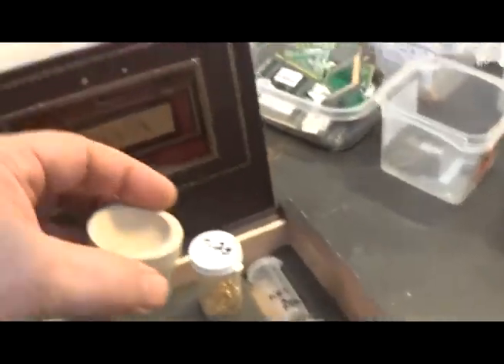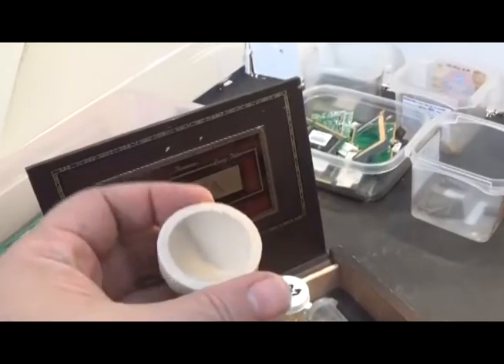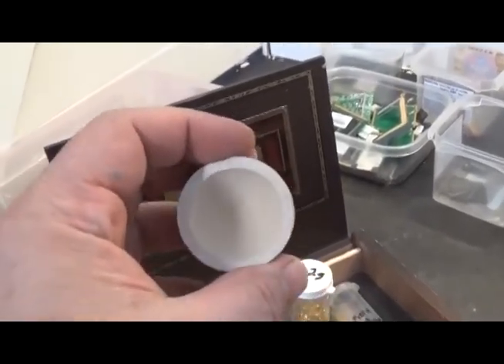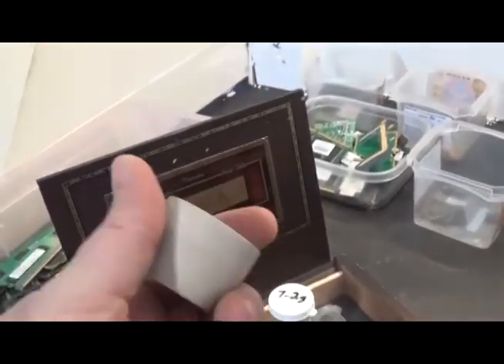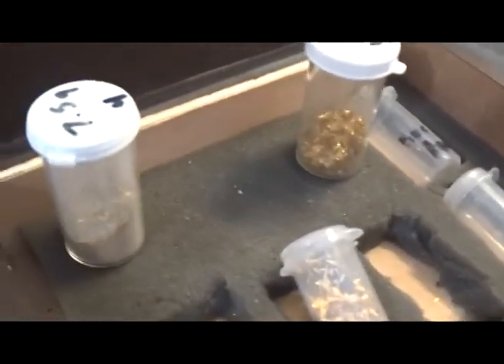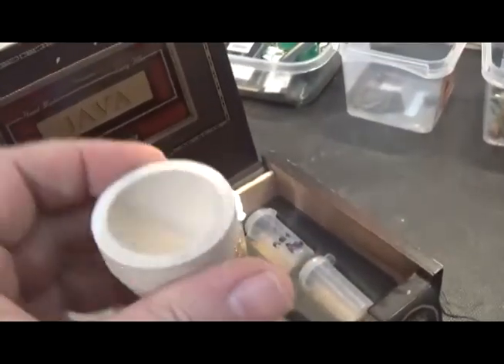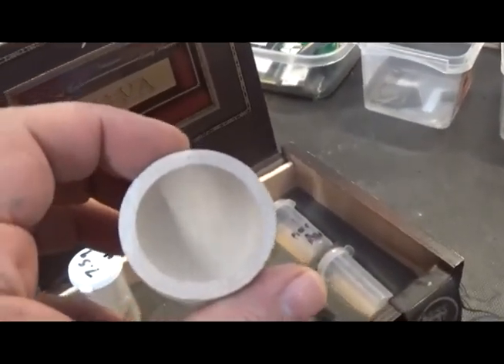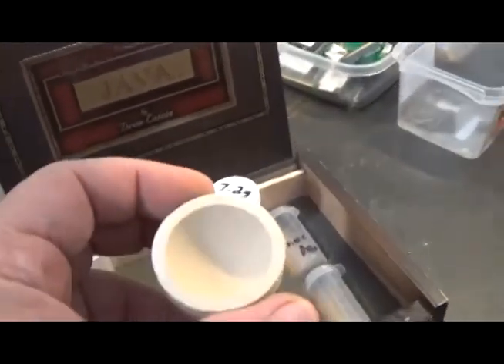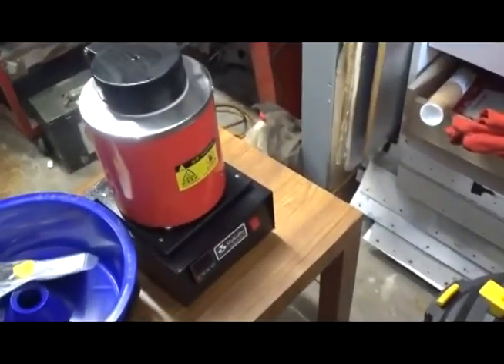We're going to put it in the crucible and drop some lead in with it — not sure how much yet. When we add the lead, the lead will bond and oxidize, correcting all the base metals in the material. This will absorb the lead, and what you're left with is a nice little button of mostly pure refined gold. We're going to take this outside since I don't have my ventilation done yet.